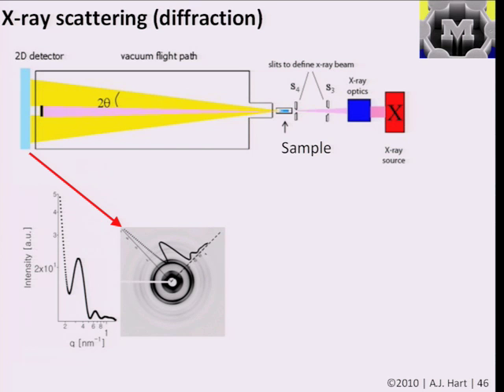And you can have different types of X-ray sources, and the type of material you can characterize, the size of sample that's needed, and for example, how long it takes to collect the data basically depends on the intensity of your X-ray source. So there are benchtop or room size X-ray diffraction instruments. There are a bunch of those on campus.